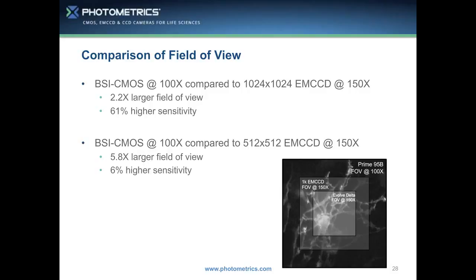The large field of view, the really high frame rates, the noise of around an electron, extremely high dynamic range. EM cameras are typically somewhere between 9 and 10 bits of actual dynamic range, even though the cameras report 16-bit data. The actual experimental dynamic range they could offer is 10 to 12 bits. And with these sensors, you're able to get almost usable, proper 16-bit dynamic range, being able to measure 60,000 different individual levels of light.